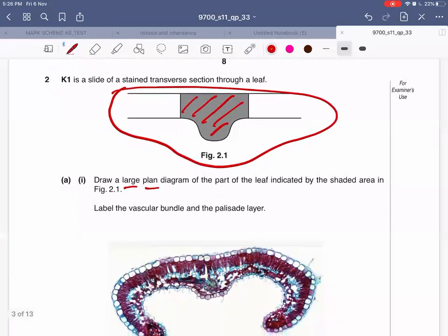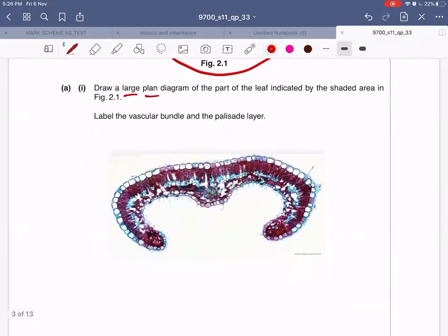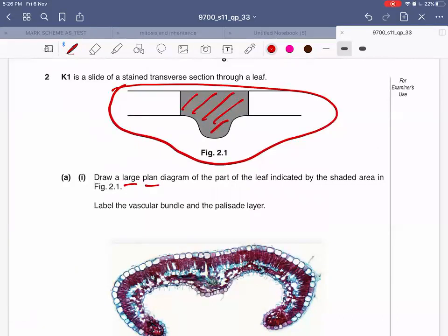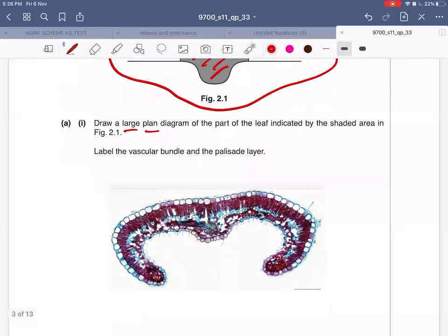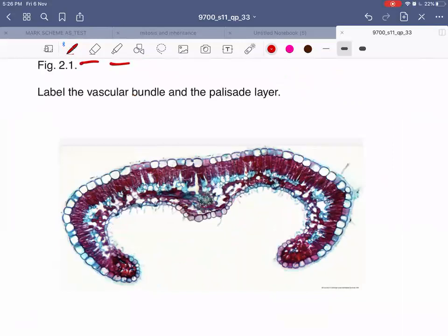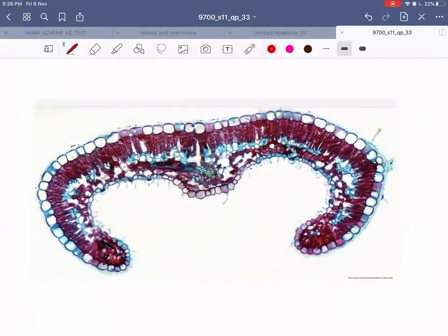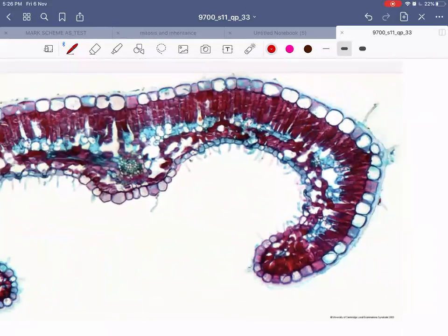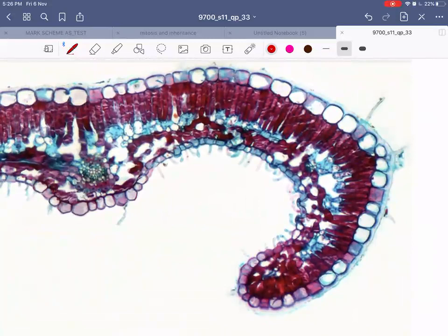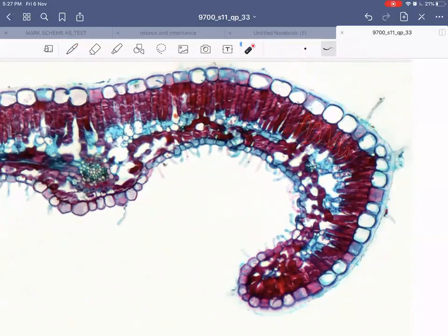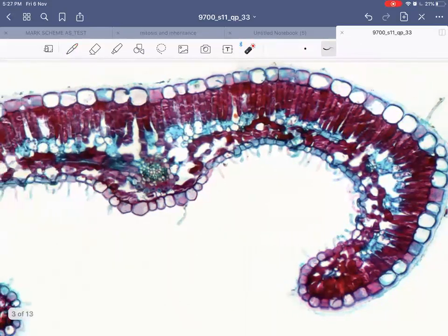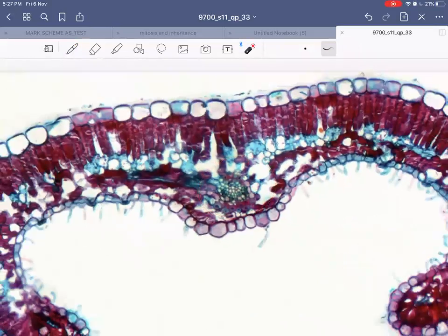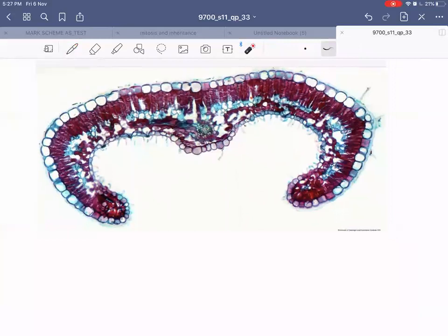The question also says to label the vascular bundle and the palisade layer. Looking at the transverse section of the leaf, there are many evidences that tell you it's a leaf - you can see the upper epidermis, the lower epidermis, the palisade mesophyll, and the spongy mesophyll cells which are scattered with lots of air spaces in between. Somewhere in the middle you can see the vascular bundle with the xylem and phloem.